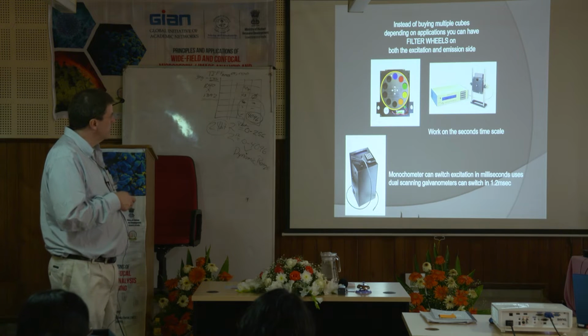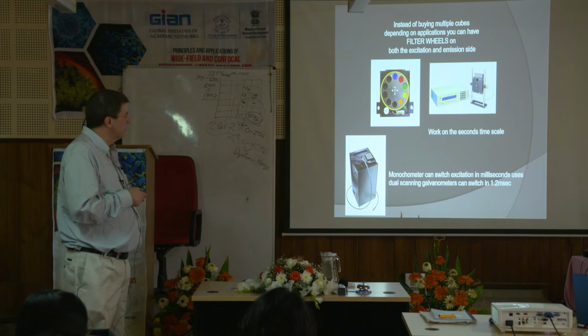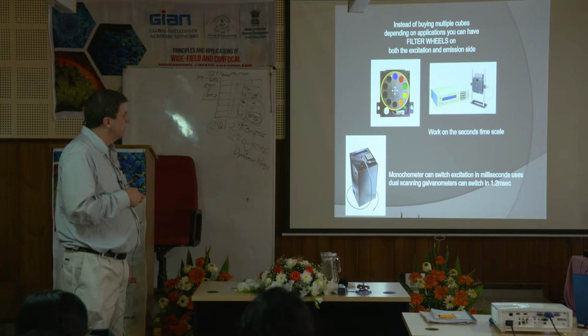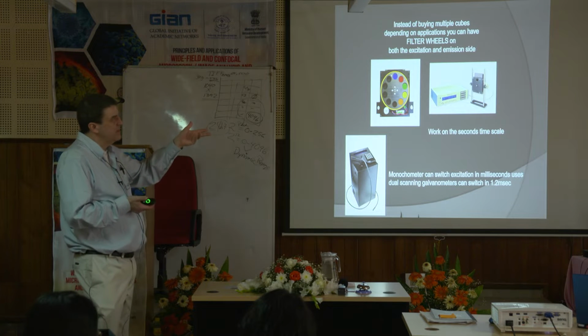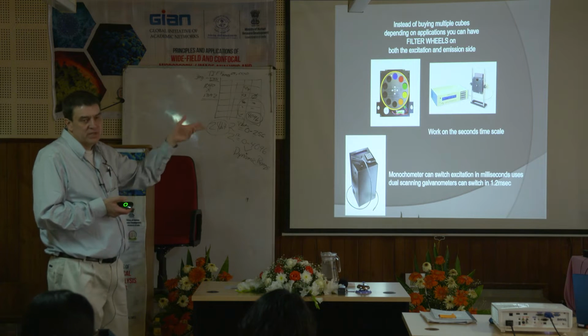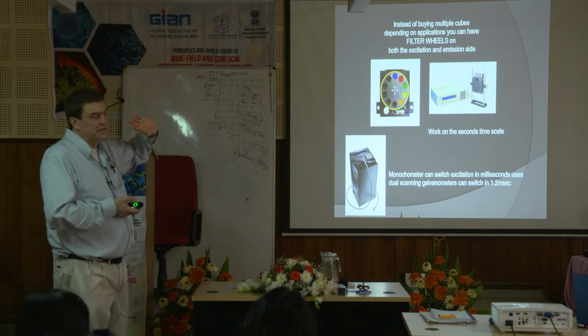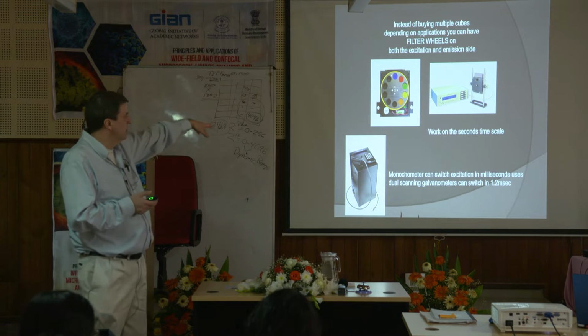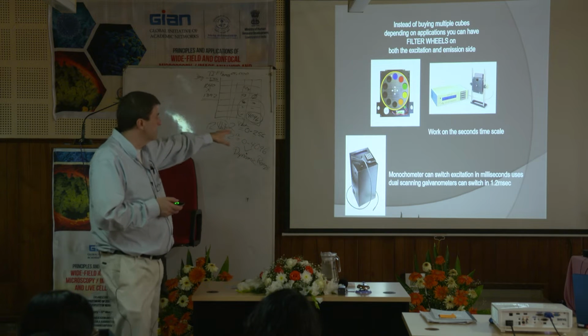So this one you could image on the second scale. Like I used to do a lot with a dye called Fluo-4 for calcium. And we go back, forth, back, forth, back, forth. And we could switch colors and take a picture every half a second or so. The very first talk here, Dr. Nair, his stuff was super fast that he was looking at.